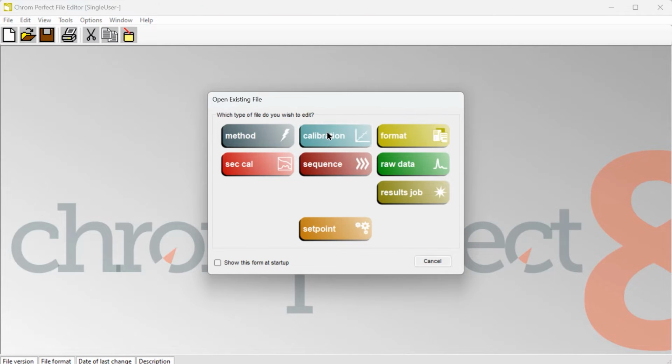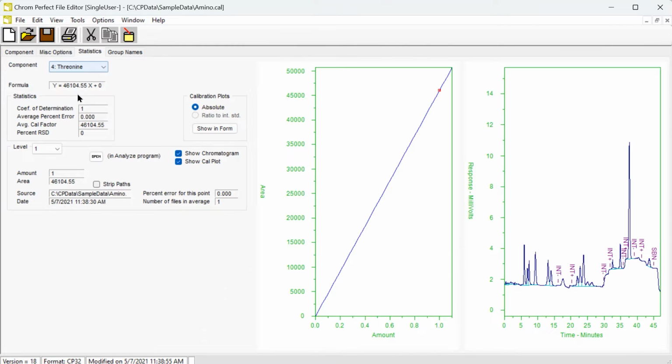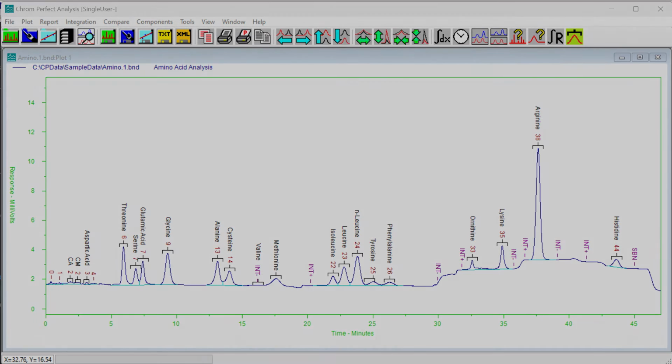Chromatography Theory, Chapter 5. Calibration Theory. This chapter explains the process of creating calibration curves. The use of calibration curves in the process of calculating amounts from peak areas or heights are covered elsewhere. Here we assume that peak detection, integration, and identification have been satisfactorily performed by the integration algorithm, so that the peak areas and heights are known.